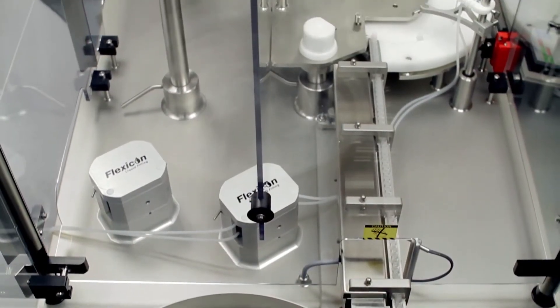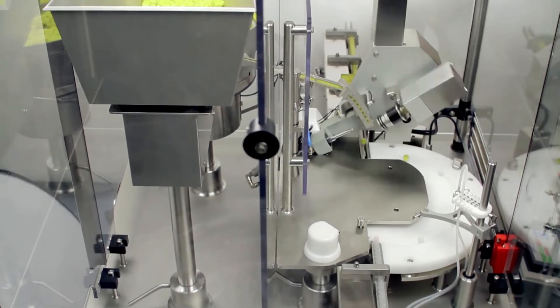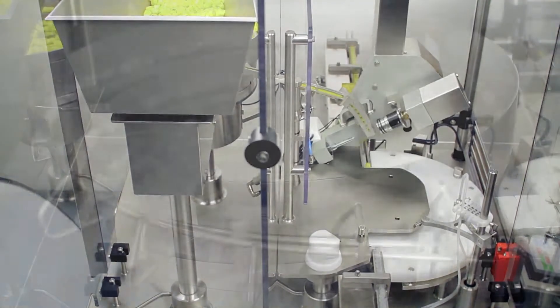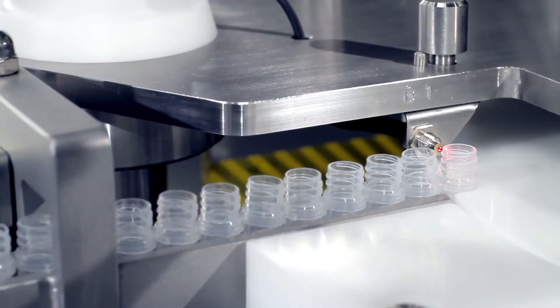We promise reliable delivery times and solutions, keeping total project costs to a minimum. Our automatic filling and capping systems have been installed in more than 37 countries, serving the diagnostic, biotech and pharmaceutical industries.